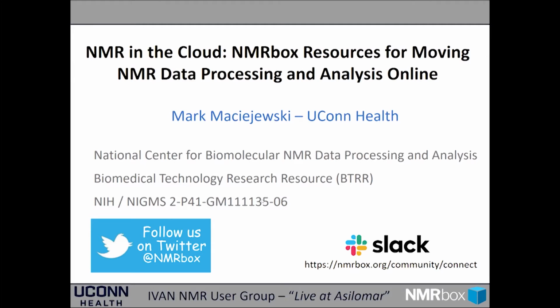So I'm going to talk about our NMRbox platform today, which is part of a P41 NIH Center grant. We are the National Center for Biomolecular NMR Data Processing and Analysis.